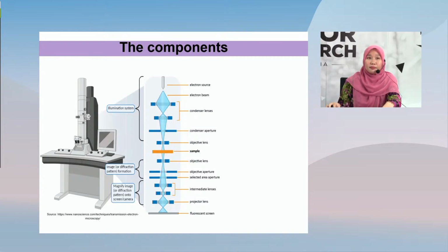Usually when the specimen is secured in the sample holder, an electron beam is generated through the electron source and shot out of the electron gun, and the electron beam is accelerated down the column of the microscope after passing through the anode.